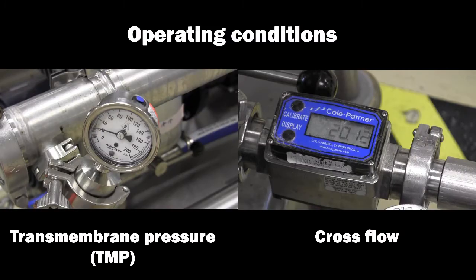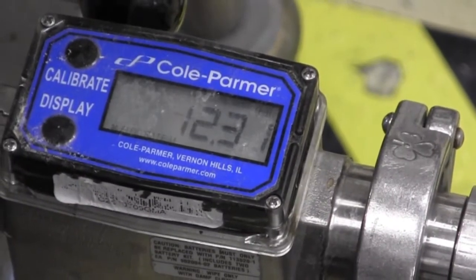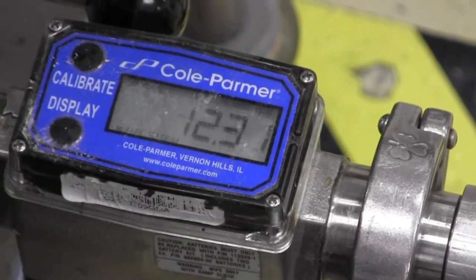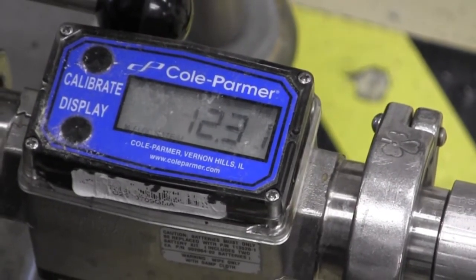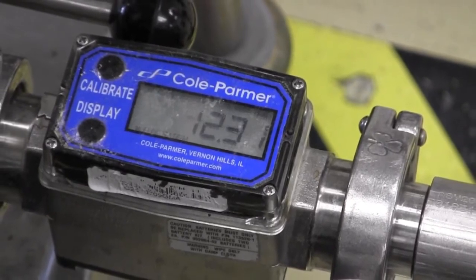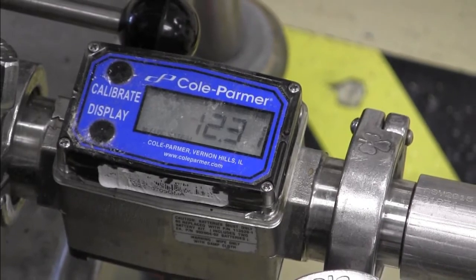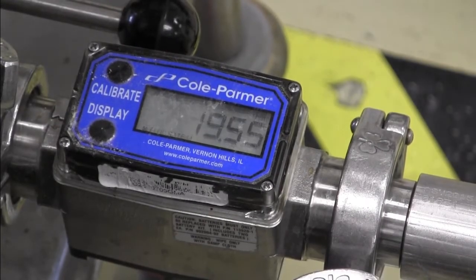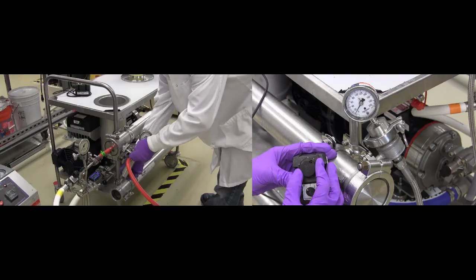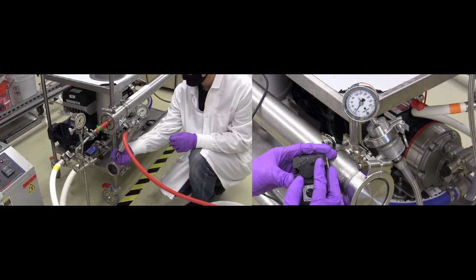In general, the goal is to maximize the TMP with a sufficient cross flow rate to prevent premature fouling of the membrane. For instance, running the system with a very high TMP but relatively low cross flow will result in an initially high flux that quickly degrades as the membrane pores are overwhelmed with accumulated particulates. A more conservative approach is to start with a high cross flow rate and a low TMP. As the process is monitored, the TMP can be gradually increased.